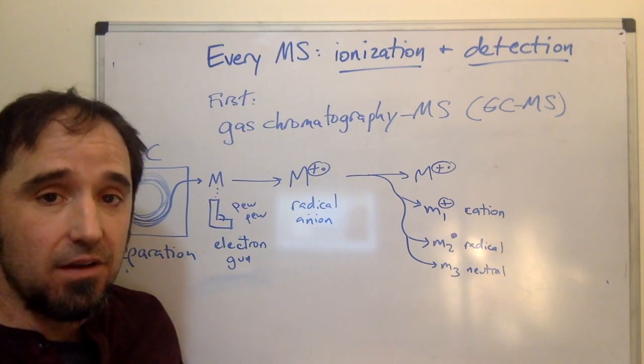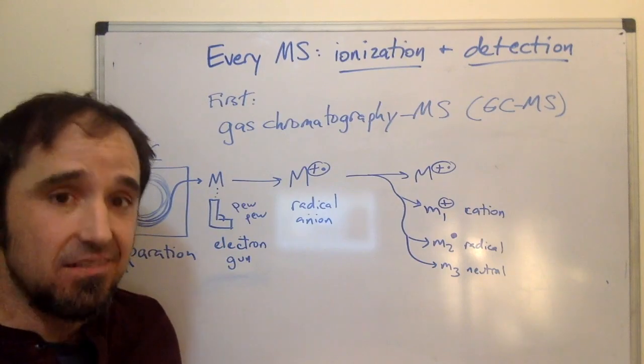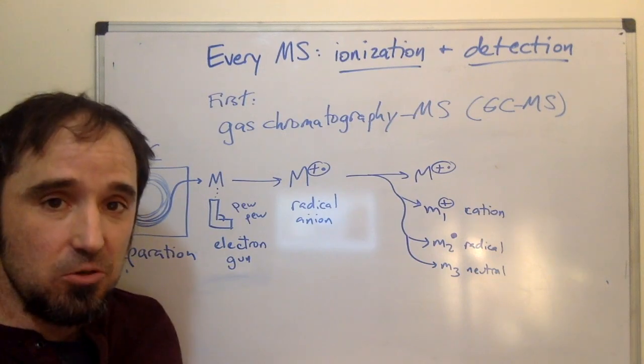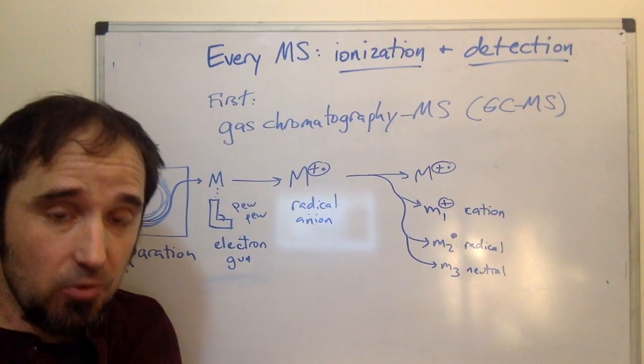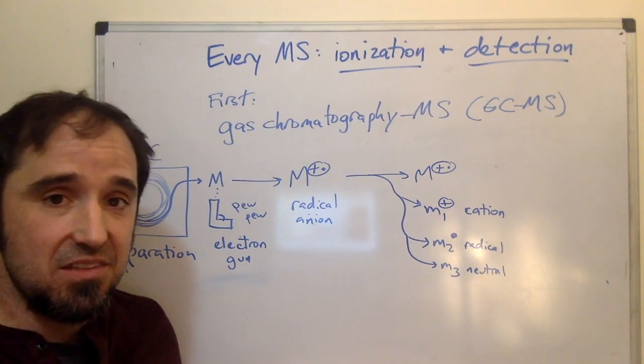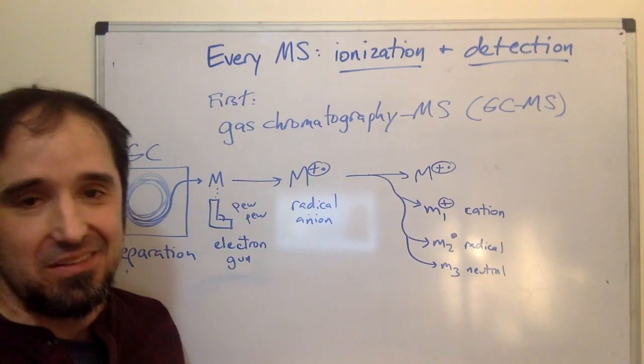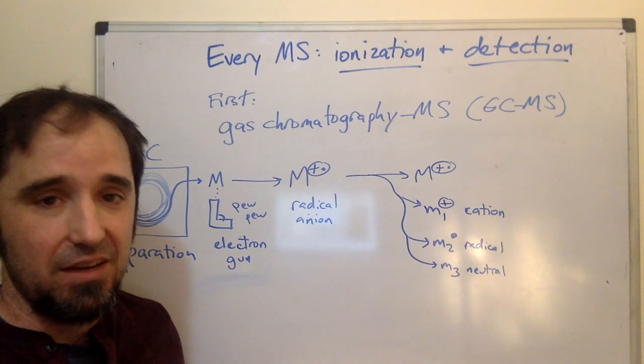So we're going to start by talking about gas chromatography mass spectrometry, GCMS, one of the most common ways to learn about small molecule structure. We have one at Lawrence. We use it a lot. We didn't use it this term because A, COVID, and B, it is broken. So it's something fun for me to fix maybe my next term.